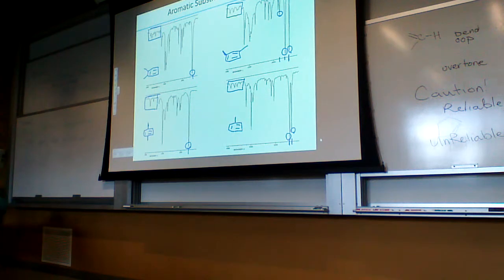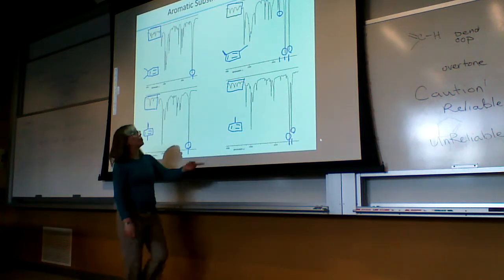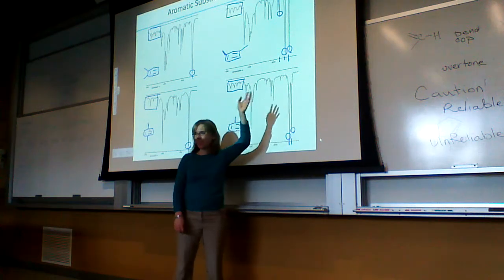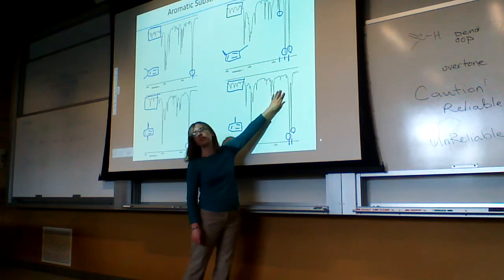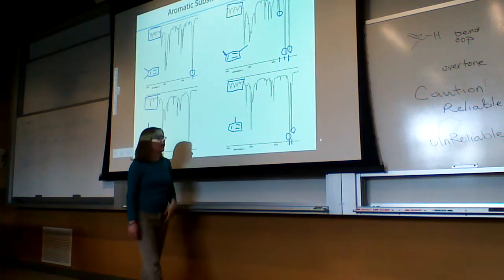Sheldon? What's the best way to tell between the toluene and the meta substitute? Because they look really similar, and when you're working with IR, how would you tell the difference without making a mistake? That's a good question. Nice caveat at the end there. You want to try and match up those patterns as close as possible. There may or may not be that extra peak around 900, but that can be shifted, or that could be covered up by other things.